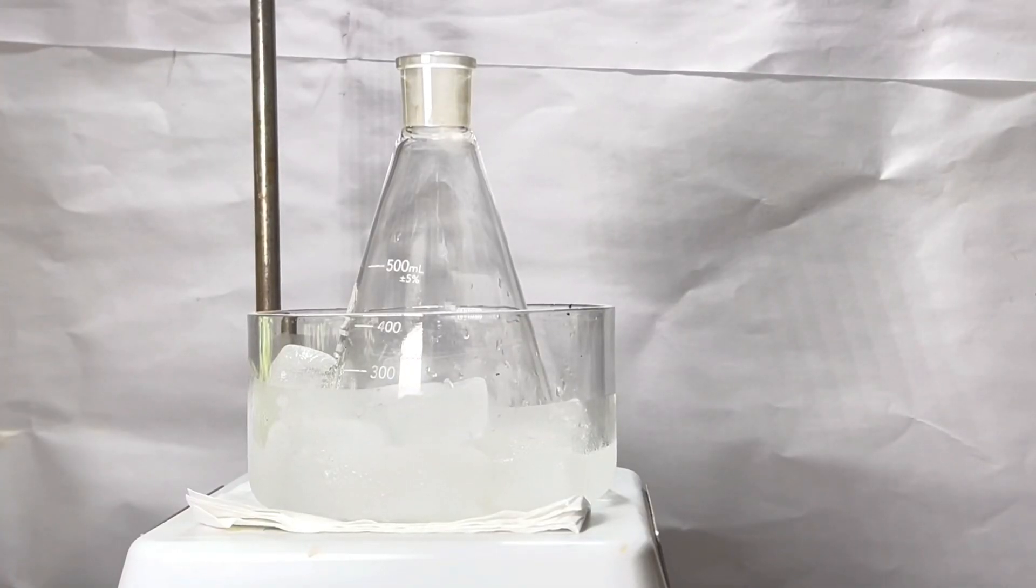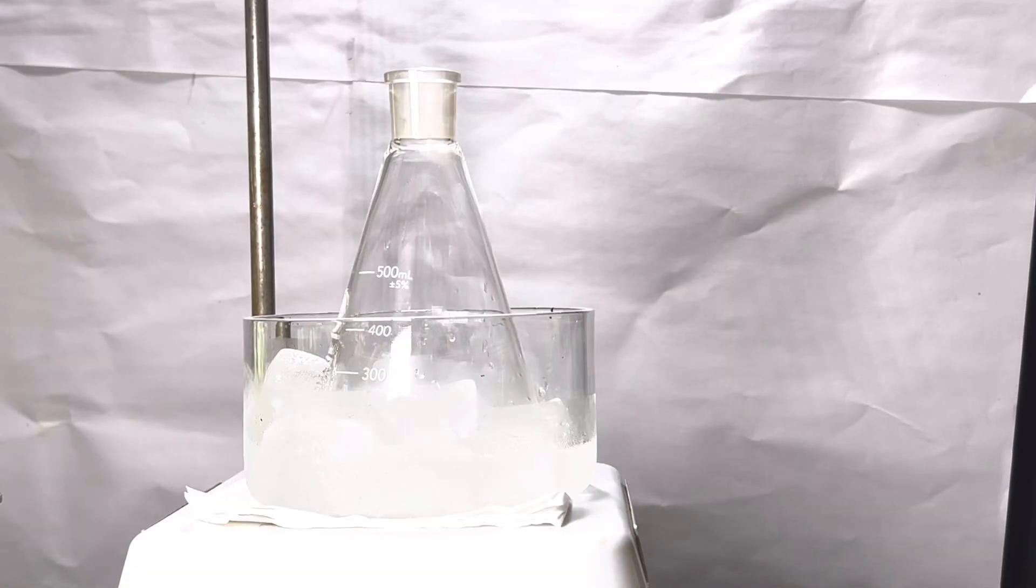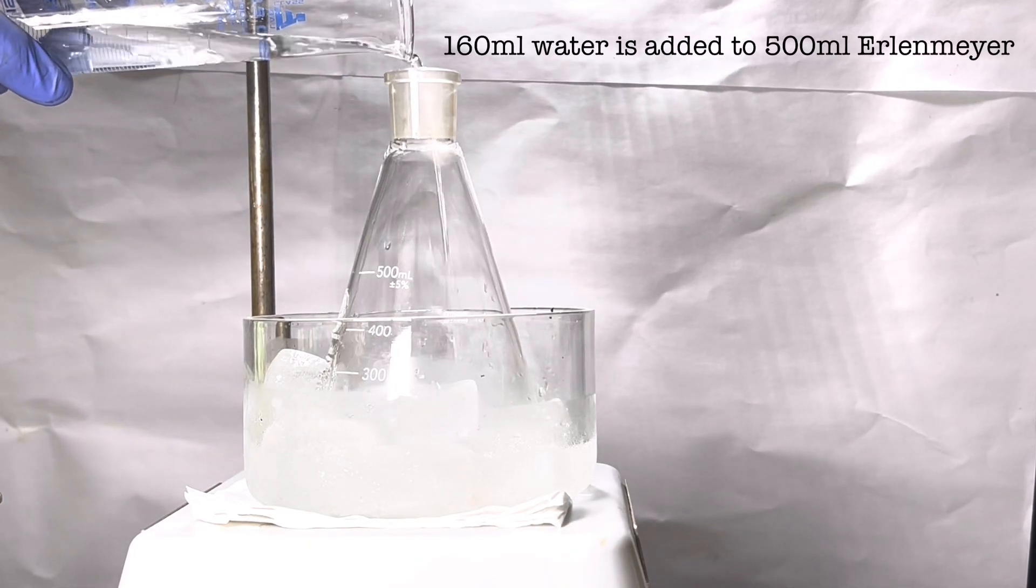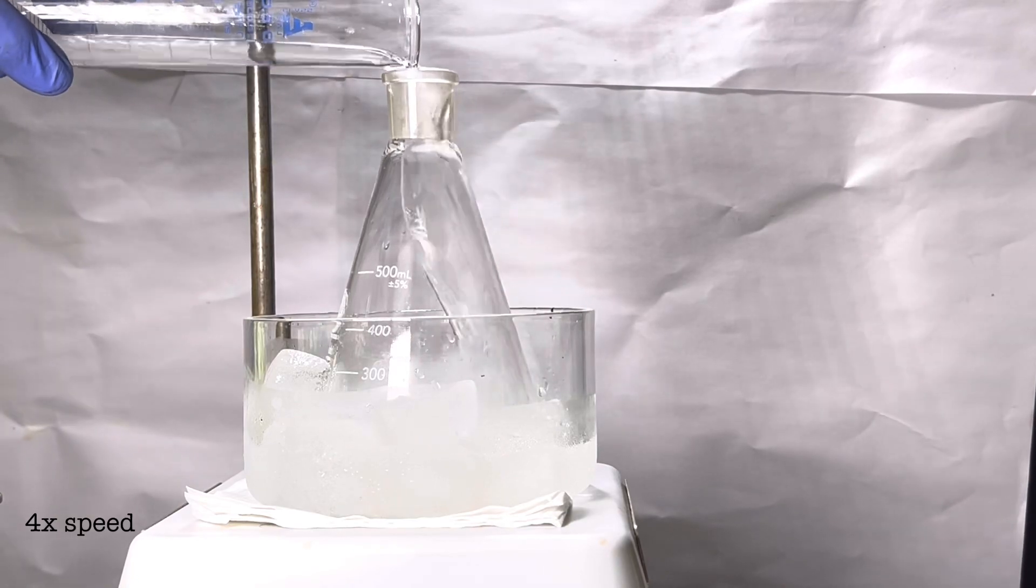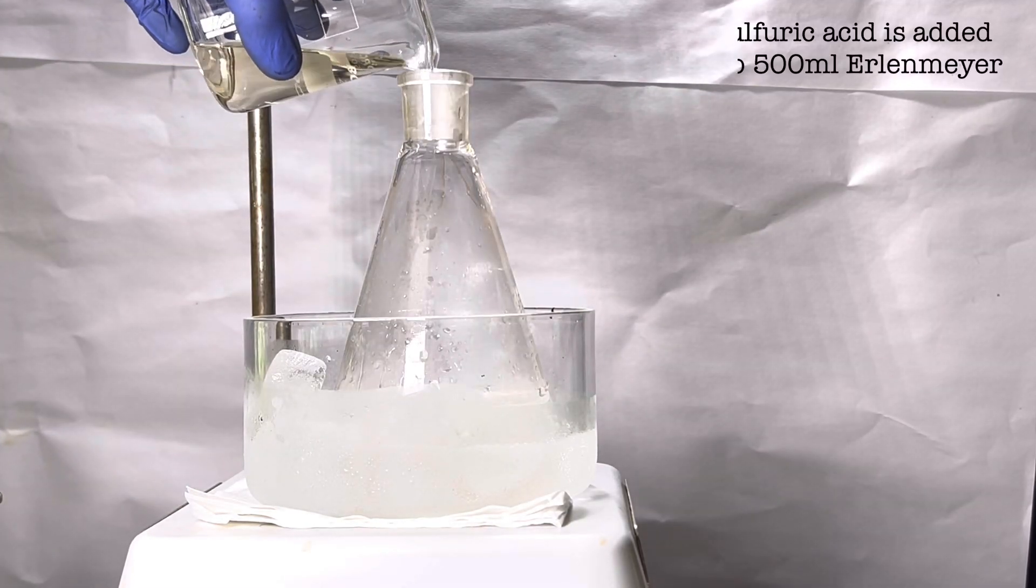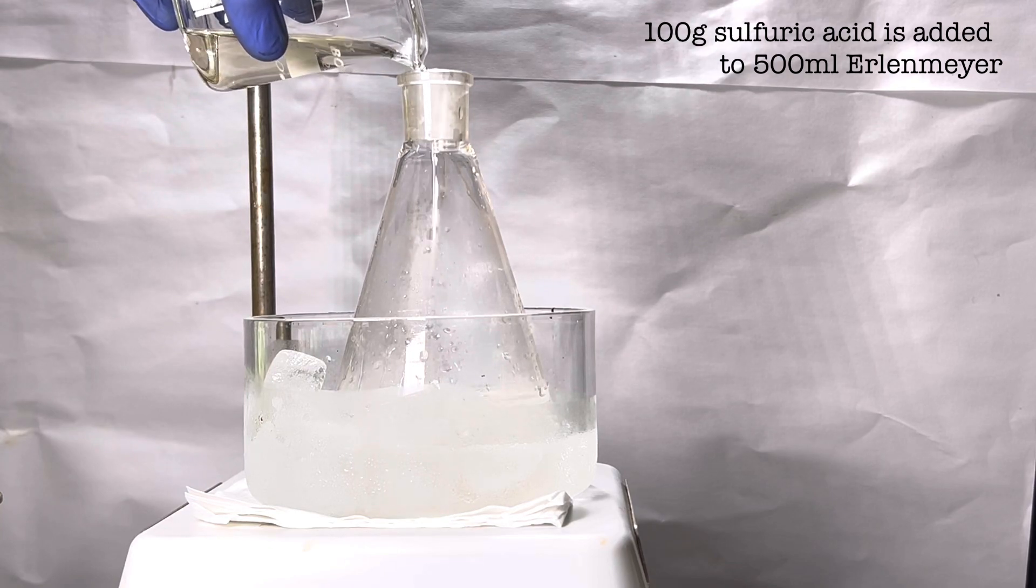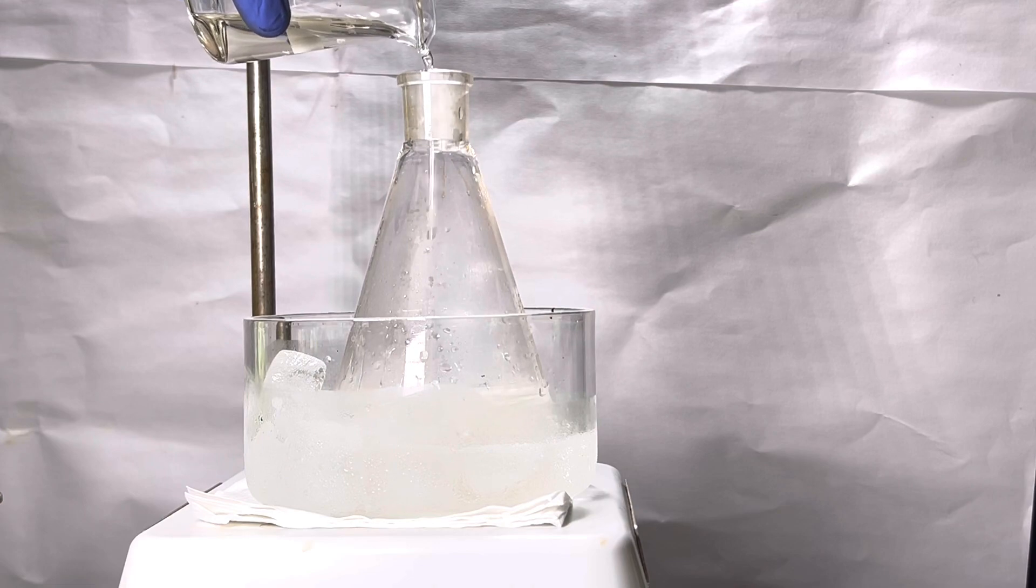A 500 milliliter Erlenmeyer was placed in an ice bath over a hot plate stirrer. A stirring bar was introduced and 160 milliliters of water was added. After the water cooled to below 10 degrees Celsius, with stirring turned on, 100 grams of concentrated 98% sulfuric acid is added slowly to the Erlenmeyer.